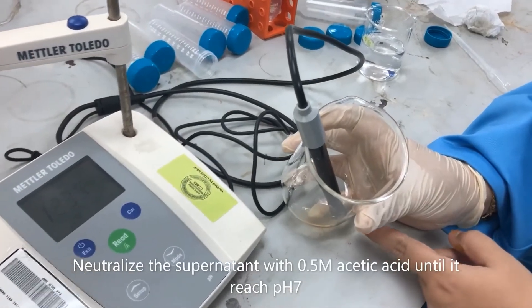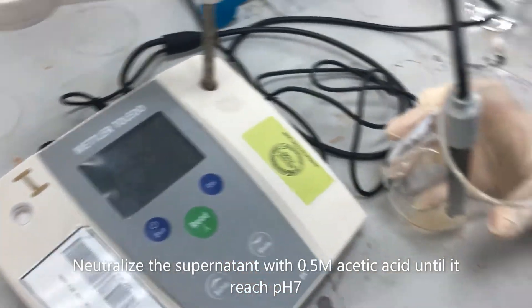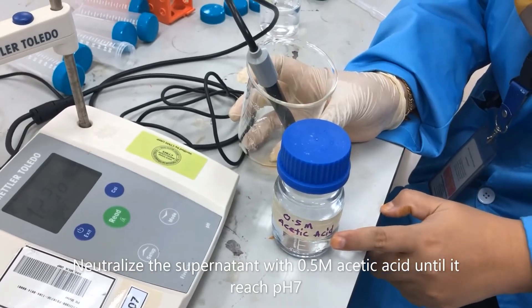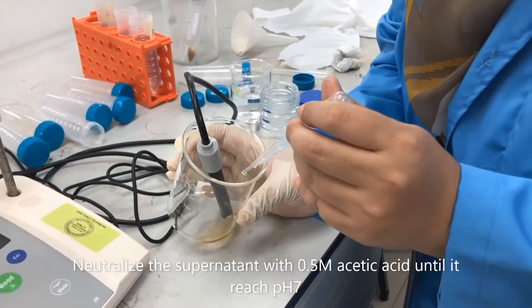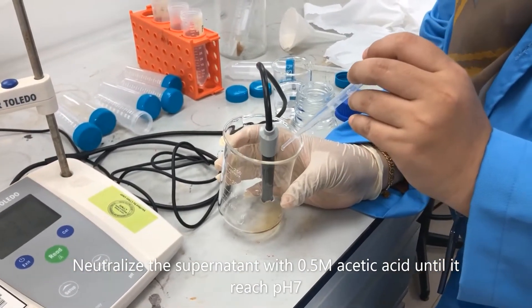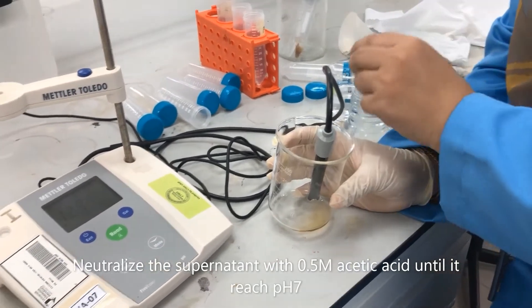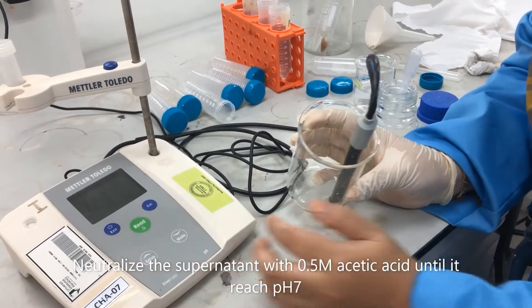This is the pectin extract. Current pH is 12, so we will mix with 0.5 molar acetic acid to reduce it until pH 7. So we drop it droplet by droplet and then measure the pH.